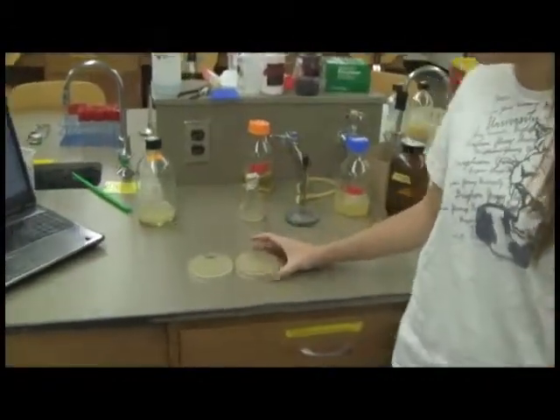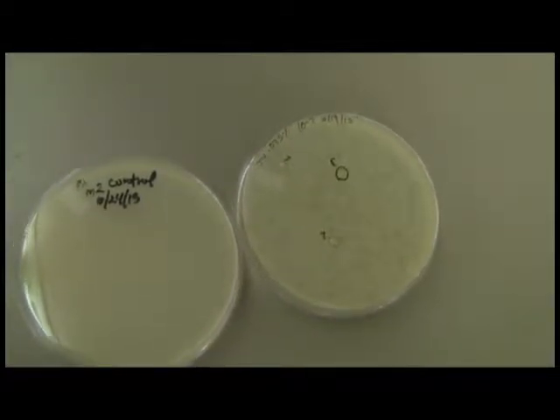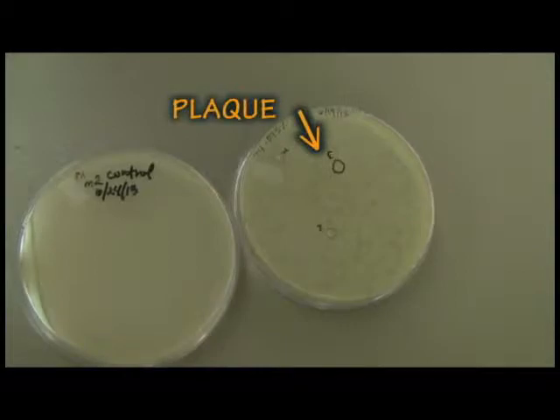A plaque is an area on a plate where no live bacterial cells are growing. These are some examples of our phage plaques. These plaques are formed from a single phage infecting a bacterial cell, replicating and lysing the bacteria. The phage then move to surrounding bacterial cells and lyse them, forming a plaque.